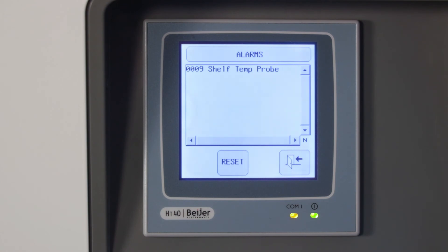In case of failures, an alarm will sound and show up on the screen. Alarms will be active until problems have been solved and the reset button has been pressed.